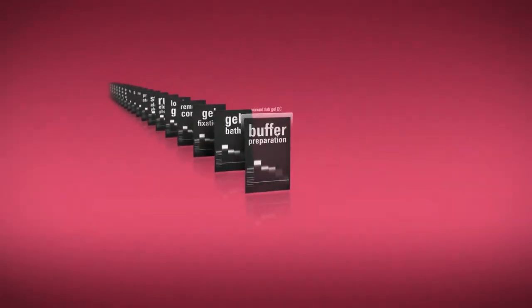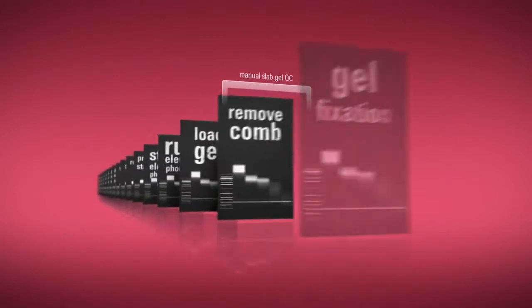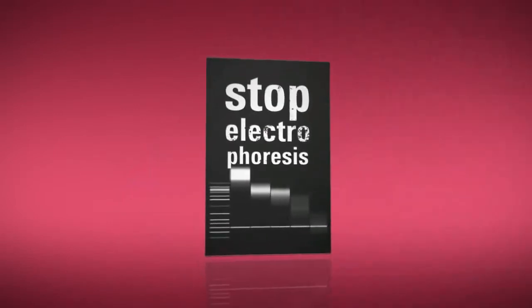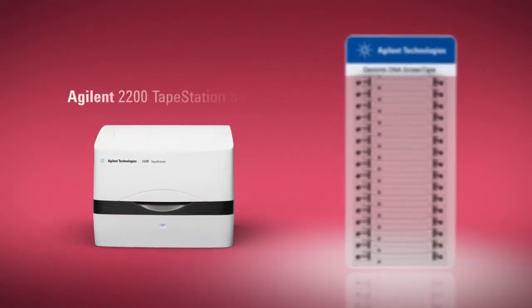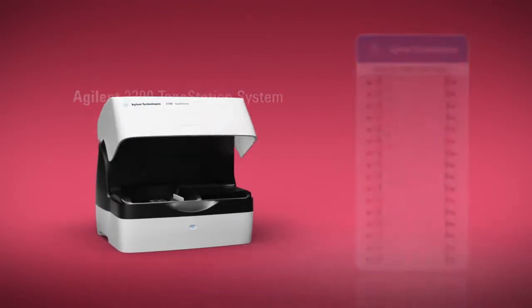Manual slab gel electrophoresis for the quality control of genomic DNA is a laborious, hazardous, and user-dependent process that can often be ignored. Instead of a process that blocks hours of your precious time, the new Agilent Genomic DNA ScreenTape, in combination with the 2200 TapeStation system, allows you to accelerate your genomic DNA sample QC.